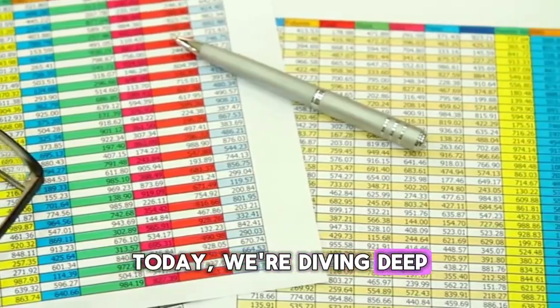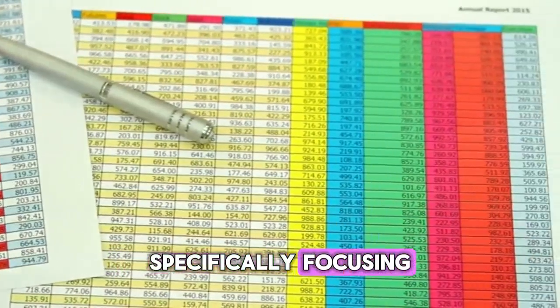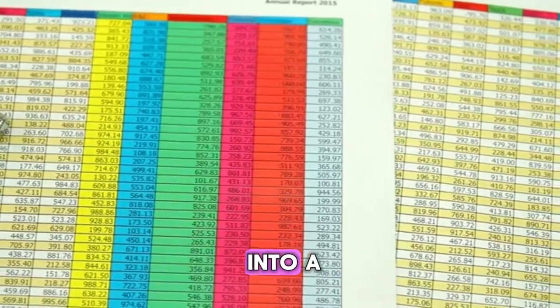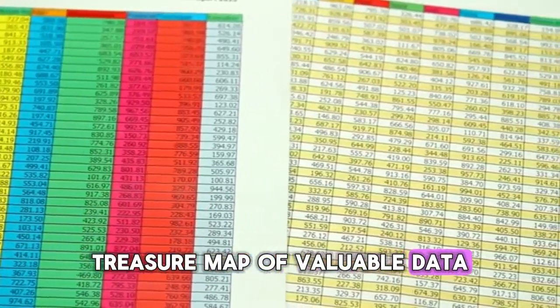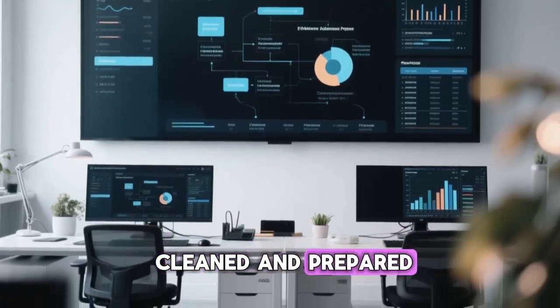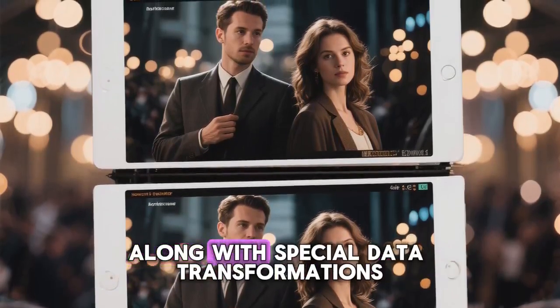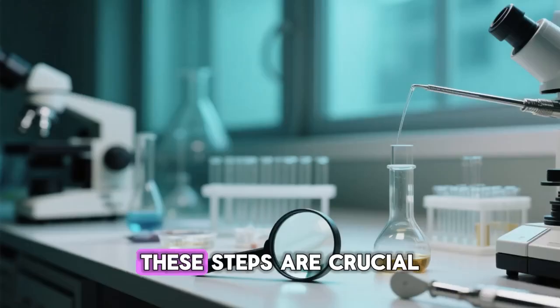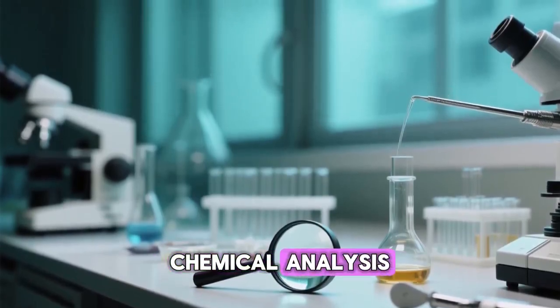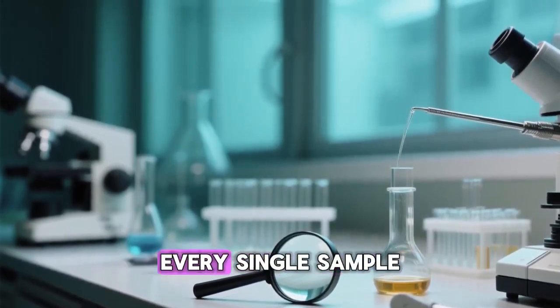Today, we're diving deep into the fascinating world of exploration geochemistry, specifically focusing on the chemical analysis methods that turn a simple rock or soil sample into a treasure map of valuable data. Before any fancy analysis can happen, the data must be cleaned and prepared. This involves rigorous quality assurance and quality control, along with special data transformations. These steps are crucial because they set the stage for high-precision chemical analysis, ensuring we get the most scientific and exploratory value out of every single sample.